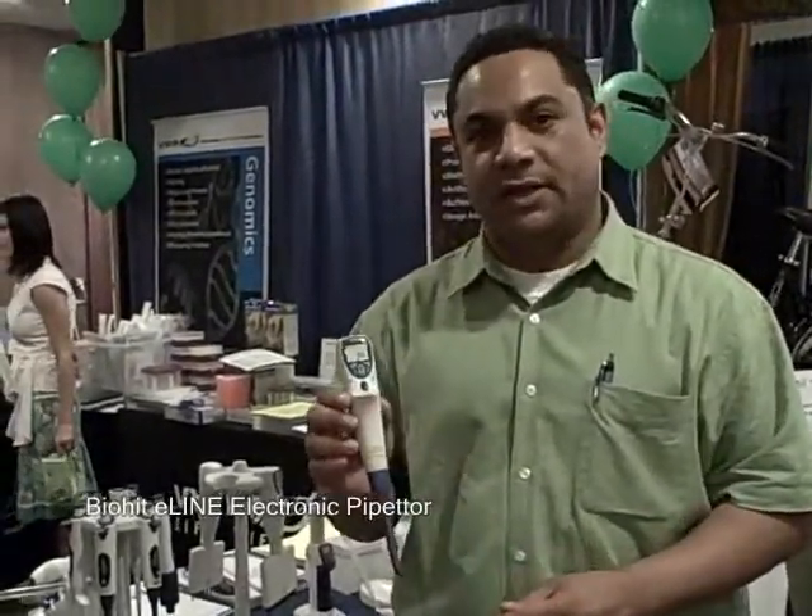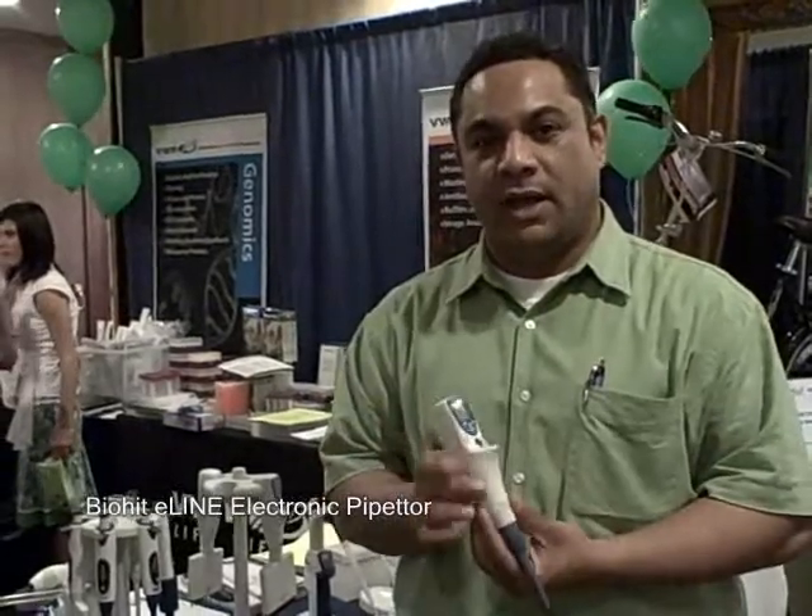Hi, I'm Mark Rattles from Biohit. I'd like to introduce the E-Line electronic pipetter, world leader of ergonomic pipetters in electronics.